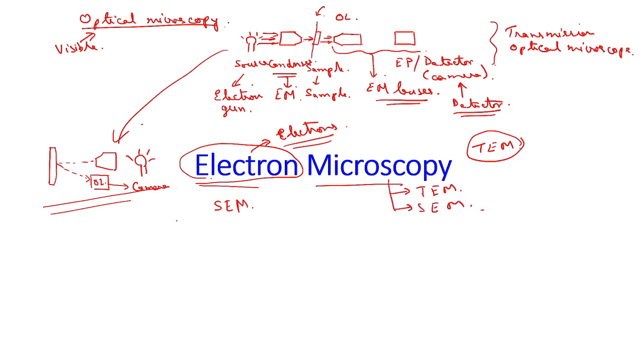The focusing elements, the lenses which are used to control the electron beam in the TEM and the SEM, remain the same. Okay, they are similar.